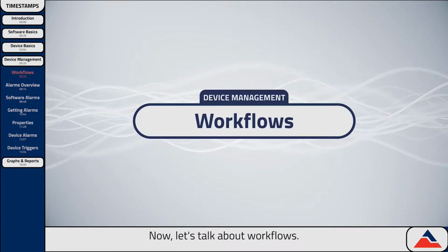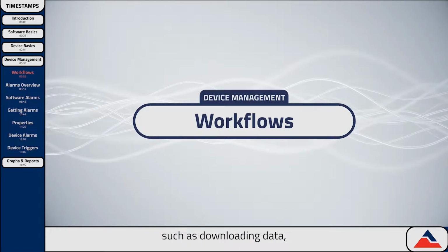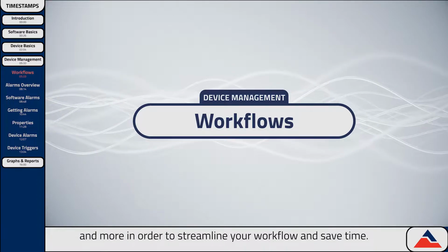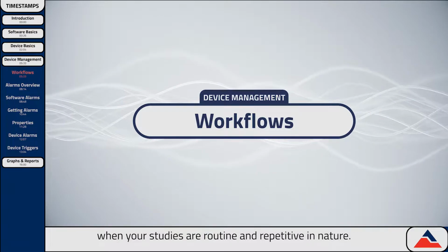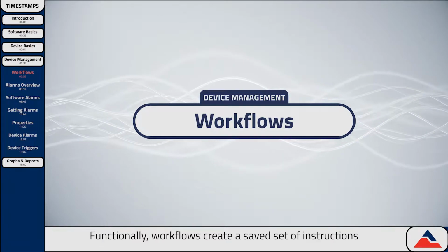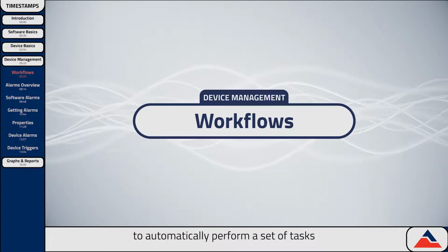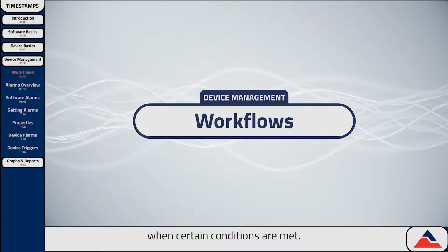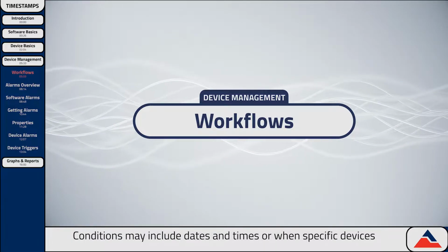Now let's talk about workflows. Workflows allow users to automate a number of tasks, such as downloading data, creating reports, and more, in order to streamline your workflow and save time. These are especially relevant when your studies are routine and repetitive in nature. Functionally, workflows create a saved set of instructions that tell the software to automatically perform a set of tasks when certain conditions are met. Conditions may include dates and times, or when specific devices are connected.